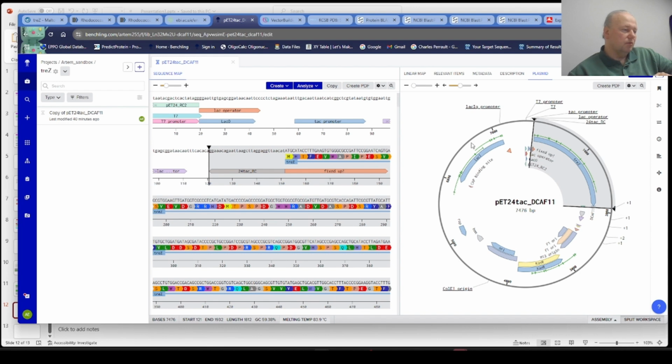I don't think that NEB mix contains ligase, although I might be wrong. In the past, it was a problem with patent conflict with the Gibson assembly method, and maybe now it's not. Either way, we're going to do it in E. coli. It will be super simple. The same exact process will be repeated for the other two genes. So we'll have a total of 5 synthetic constructs, 4 for mammalian, of which 2 will be secreted, and then 1 for E. coli cytoplasmic expression.